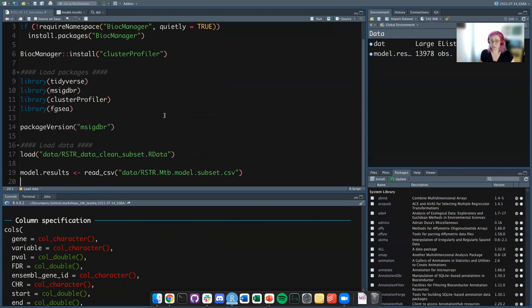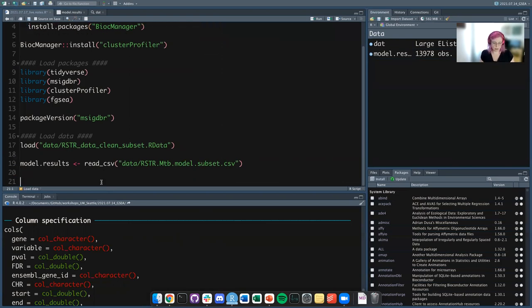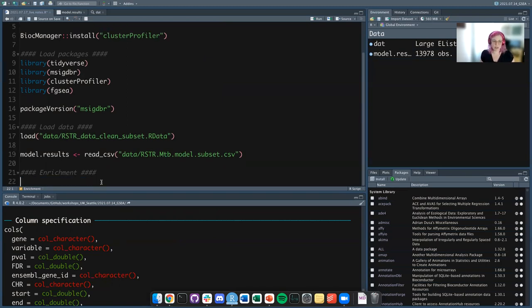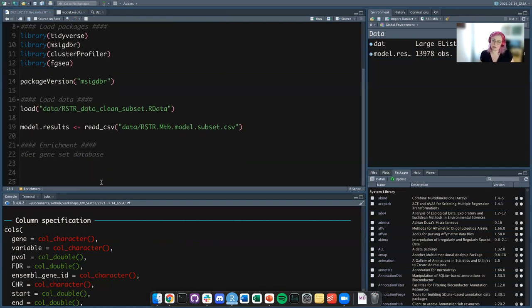Now we're going to run enrichment. For all that it is — it's just a Fisher's exact test — the meat and potatoes of running it is making sure everything is formatted correctly to play nicely with clusterProfiler. To run enrichment, the first thing is we need to get our database. We're going to run Hallmark because it's the fastest and the smallest, and also where we generally start.